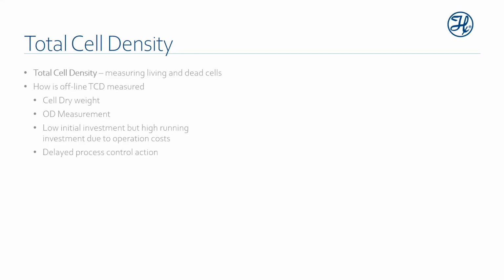Now, offline measurement has a lower initial investment cost. However, it has high operating costs due to the fact that it requires labor, physically somebody in the lab to take a sample and make the measurement. As well, because it's a discrete measurement at a specific time point, and a certain amount of time is required to make the measurement, we call it a delayed measurement. A certain window of time has passed, and so any action taken from this is still a reactive action.